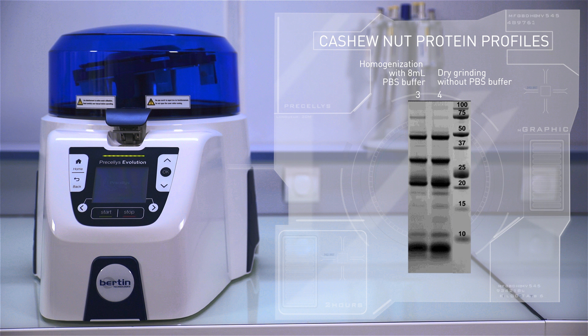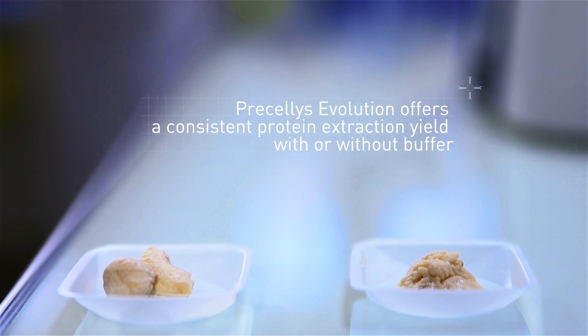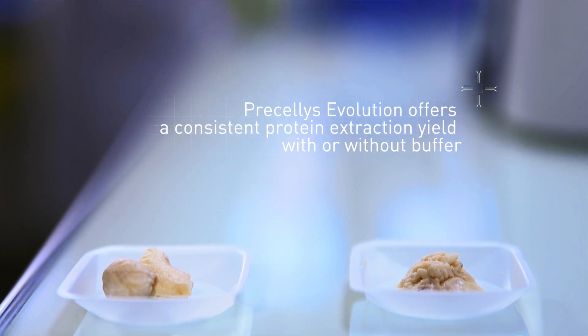From dry or hydrated samples without buffer, which is a real advantage for obtaining highly concentrated proteins.